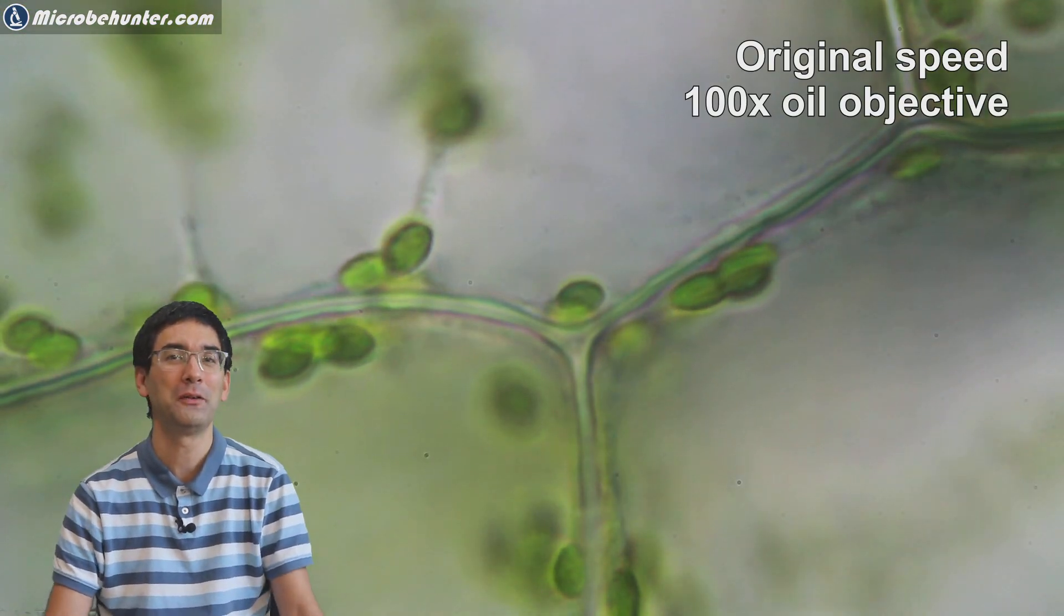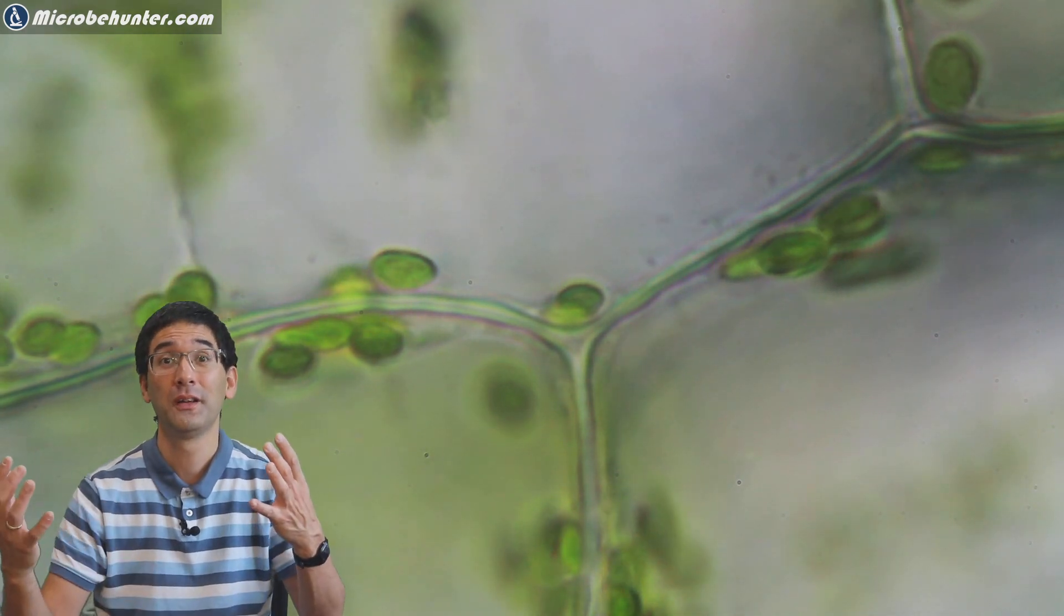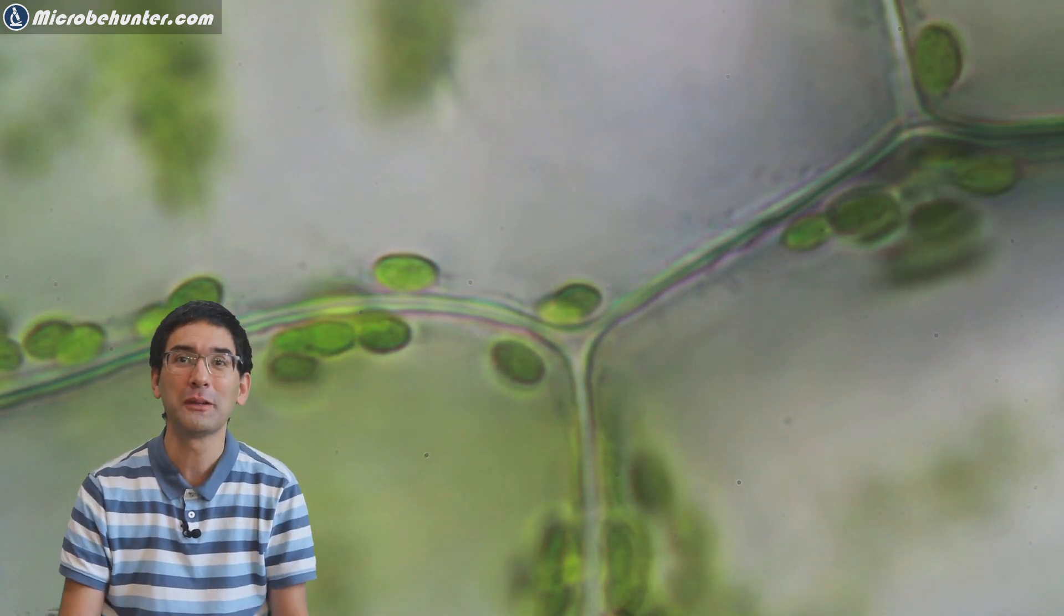There are a whole bunch of interesting little experiments that one could do now, like change the light color or the light intensity or temperature and then see how the chloroplasts move differently depending on the different environmental factors.